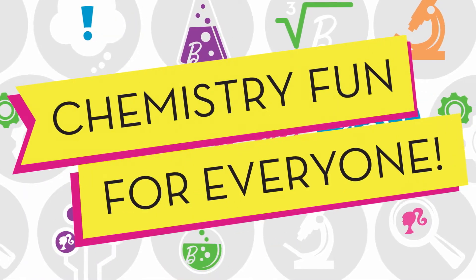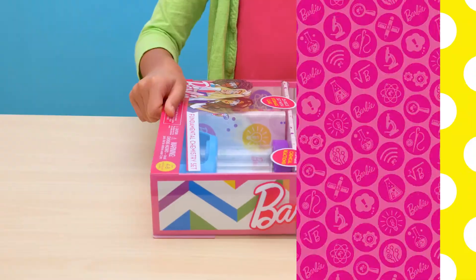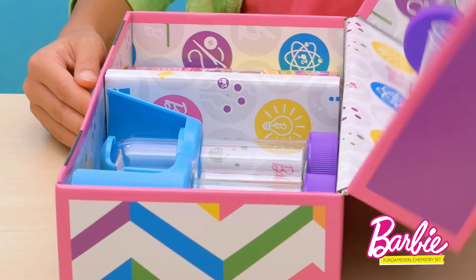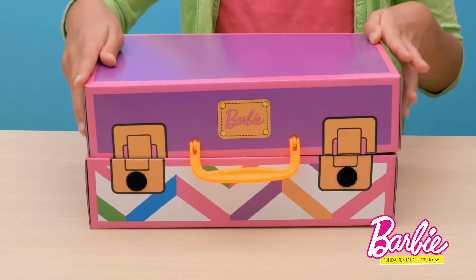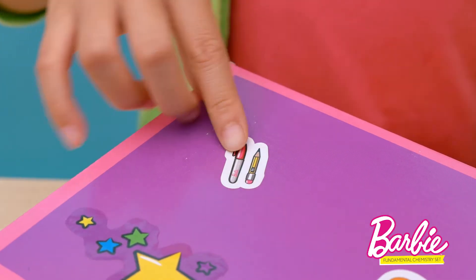It's chemistry fun for everyone with the Barbie Fundamental Chemistry Set. Let's get started! Your Barbie Chemistry Set comes packaged in its very own portable trunk. Have fun and make it your own by decorating your trunk with the included stickers.